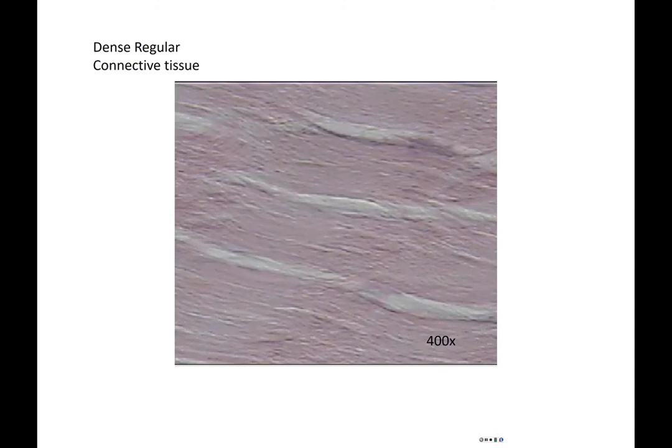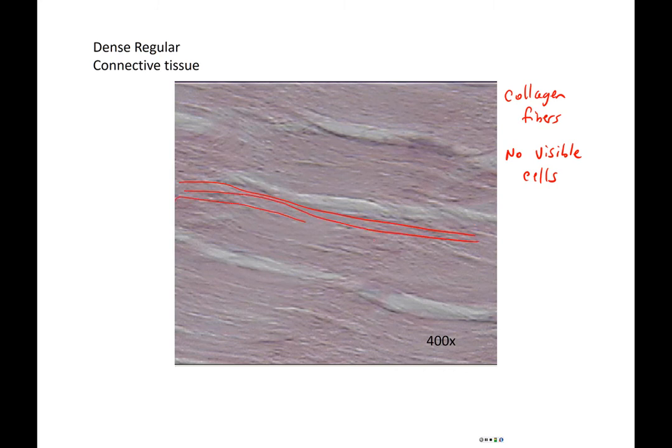Your dense regular connective tissue you can see is dominated by collagen fibers. You have a few if any visible cells. So you're seeing basically your fibers are running in a parallel direction throughout the whole screen here. Our ligaments and tendons are composed of dense regular connective tissue.